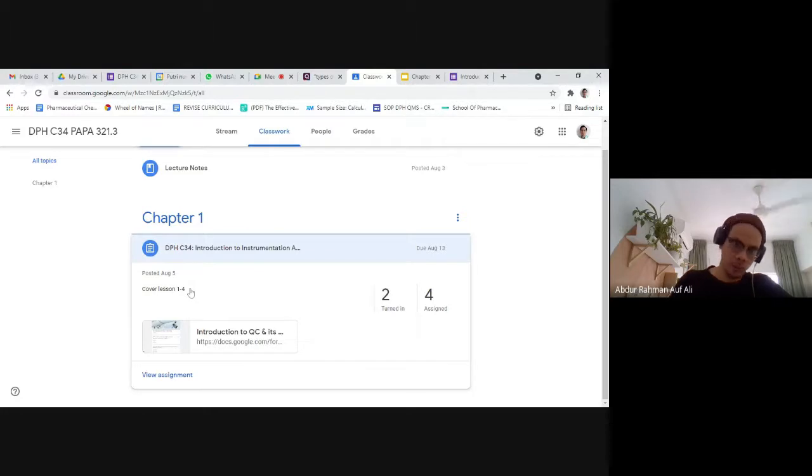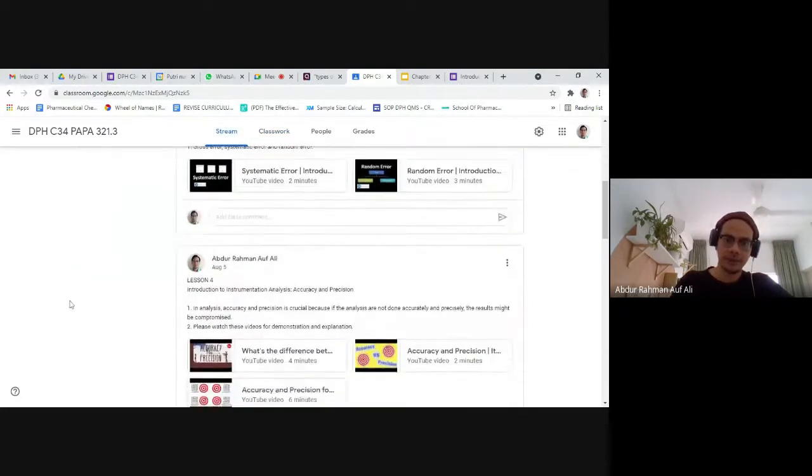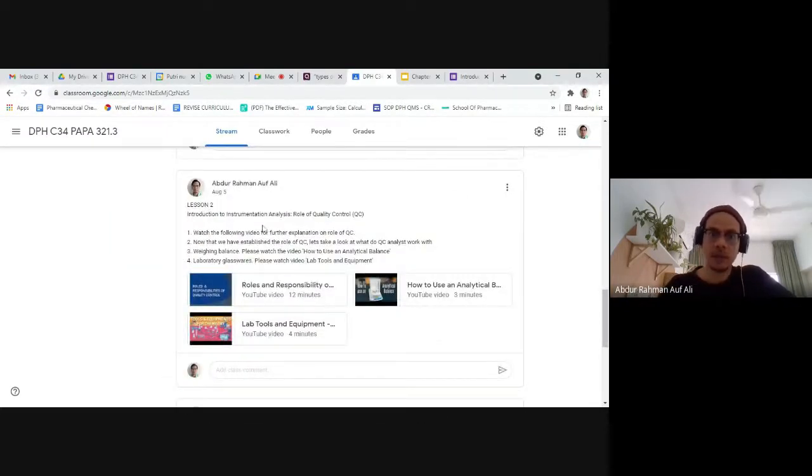So some of the questions will be based on the video yang saya attach. So kalau macam contohnya soalan tadi pasal weighing balance, so dia ada di cover, ada diceritakan dalam video ini, how to use an analytical balance, lab tools and equipment, because we perform analysis using glasswares, using chemicals, using instruments, using lab tools. So you have to be familiar with all these things.